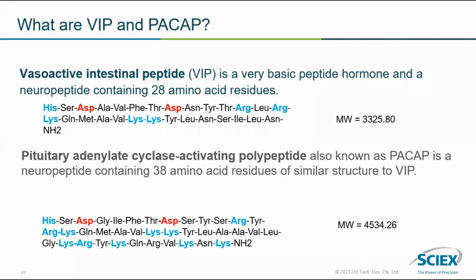This color coding, blue and red, demonstrates that the blue ones are the basic amino acids and the red ones are the acidic amino acids. Sometimes, if your peptide contains a high level of basic amino acids, this kind of molecule is difficult to analyze by conventional LCMS technology. If your peptide contains basic species, you sometimes need good method development and a challenging approach in terms of LCMS.